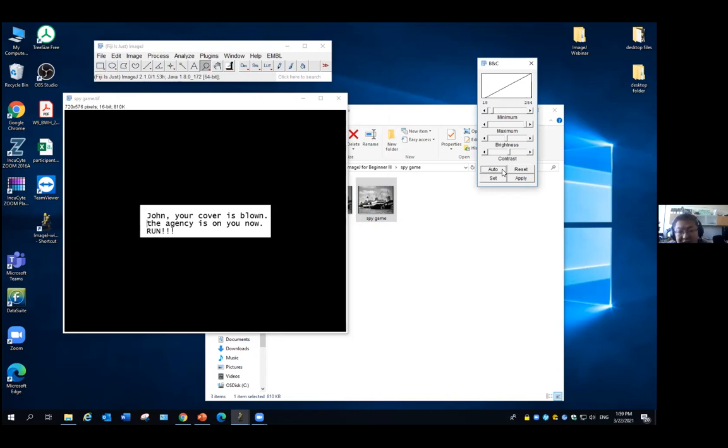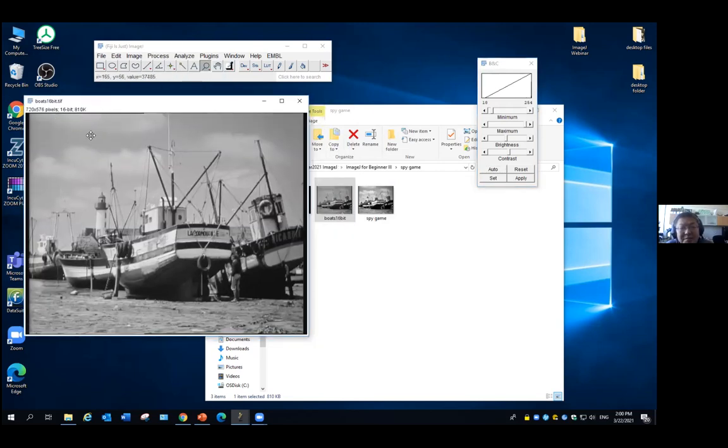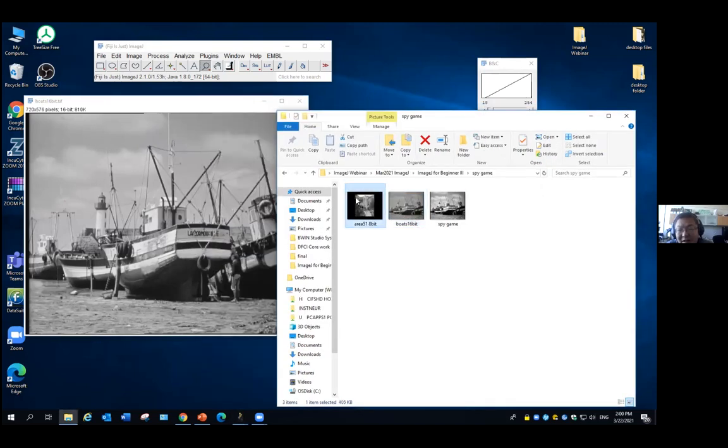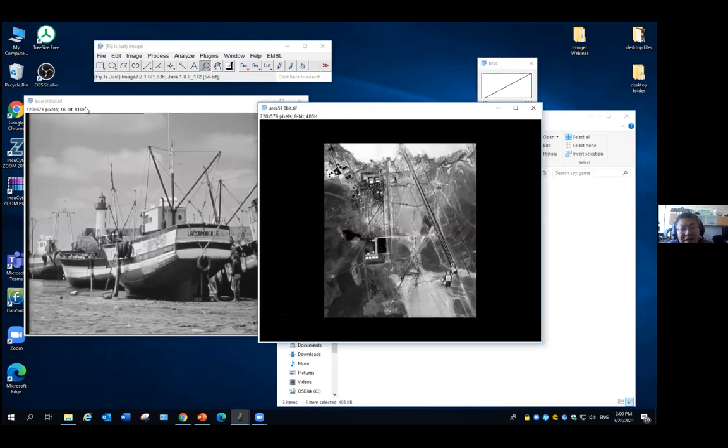This is a very classic way to hide one image in another image. The whole point of doing this is that your hidden image, your secret image, only uses the lower bit part of your original image. If you want to hide your own message, I can show you a simple step to do it here. So if this is our original image, you make it 16 bits. And this is our hidden image. These two images have to be the same size.